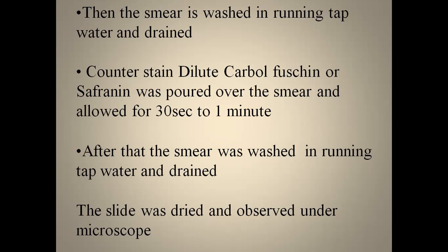Then after that, the smear is washed in running tap water, and you have to make it dry. Then the slide is dried and observed under the microscope.